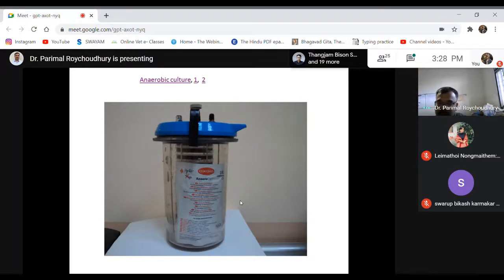Okay, so in this class I tried to give you some information about bacteriological media, how they can be prepared, what the basic components and the different categories are, and some of the examples that are given in your manual. Exactly, I depicted them here. At this stage, of course, it will be difficult for you to remember the function of each and every media, but at least you will get an idea of how these bacteriological media help us in identification and isolation of bacteria.